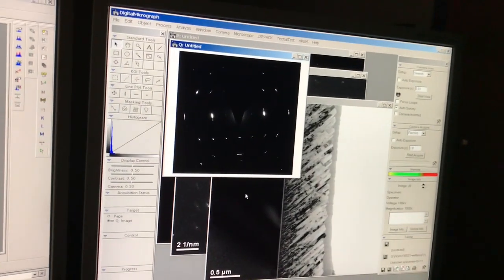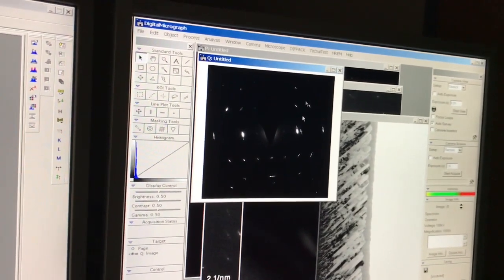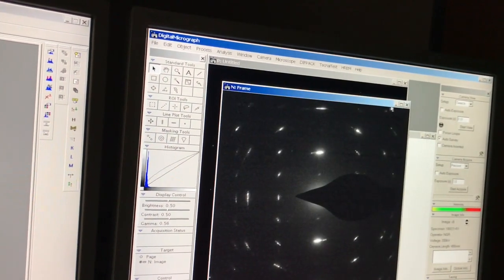So this is useful now because, without going into, again, all the details, if we look here, I'm going to pull up the silicon one.